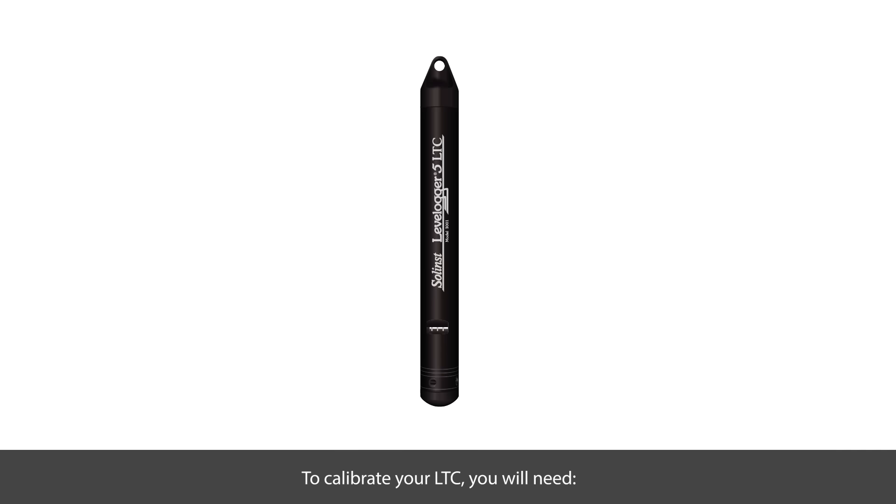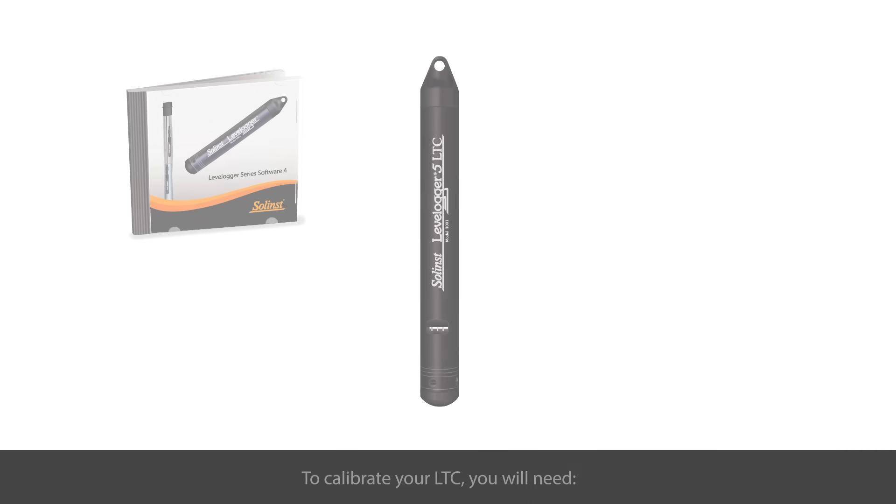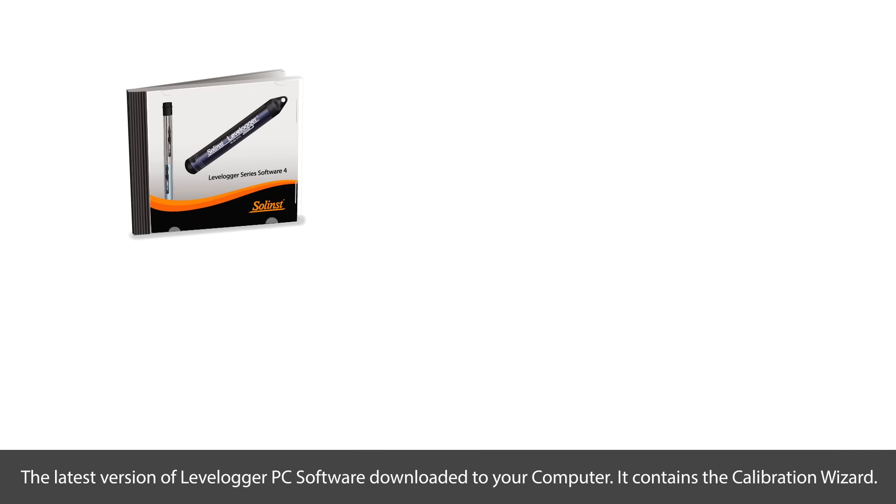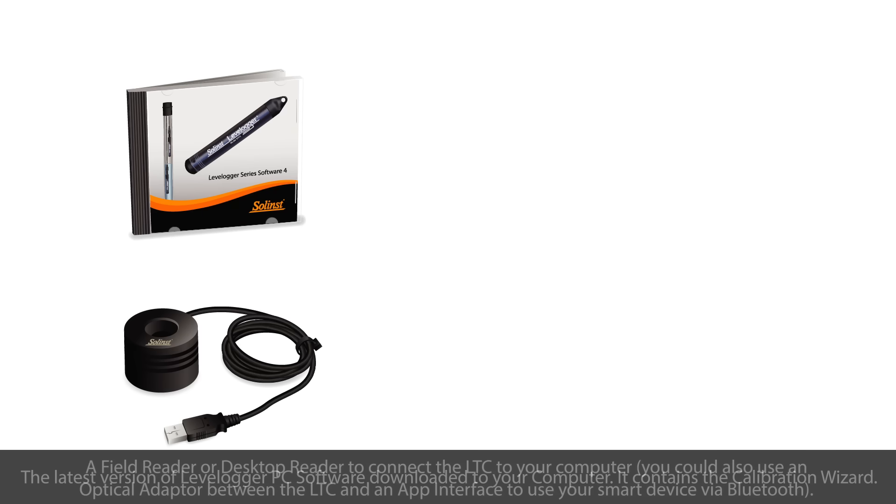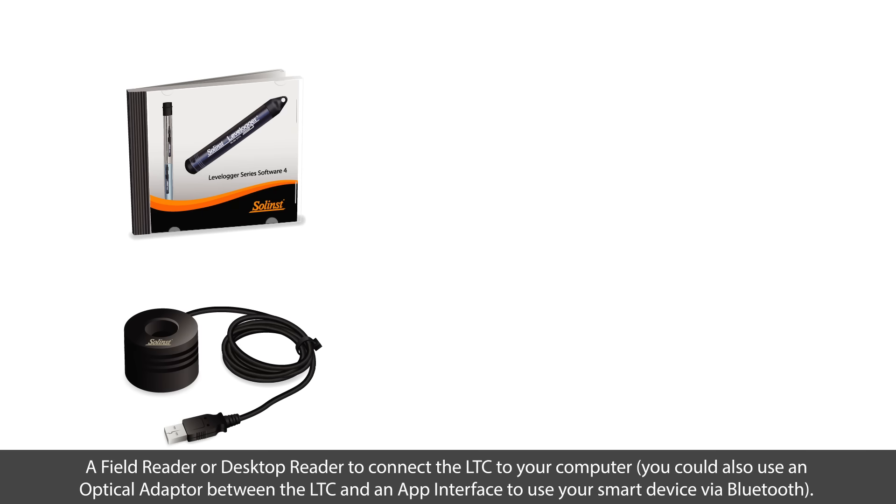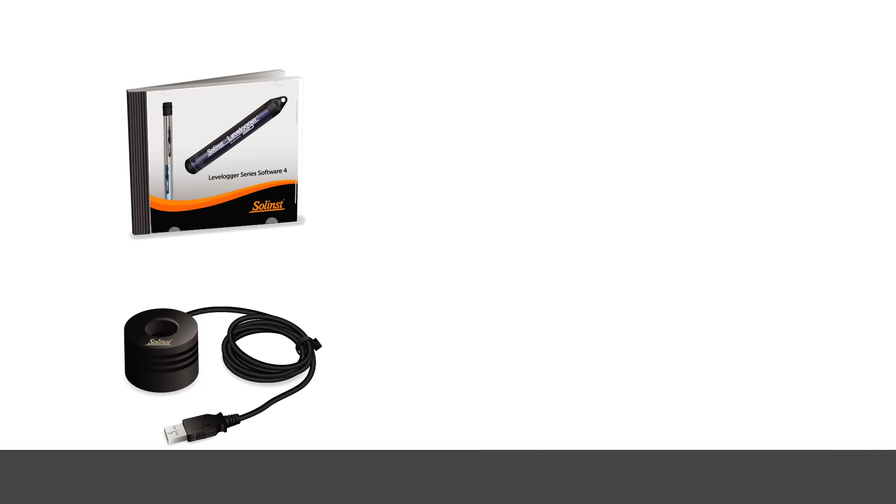To calibrate your LTC, you'll need the latest version of LevelLogger PC software downloaded to your computer. This contains the calibration wizard. To connect the LTC to your computer, you'll need a field reader or desktop reader. Alternatively, you could use an optical adapter between the LTC and an app interface, so you could use your smart device via Bluetooth.